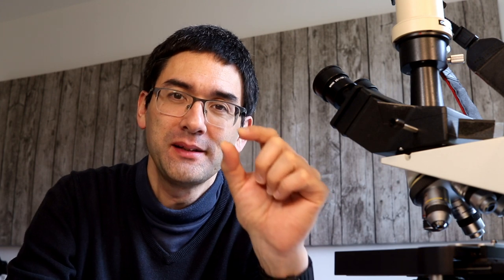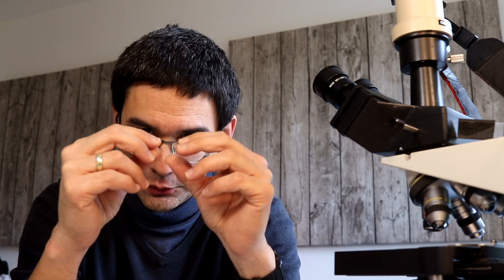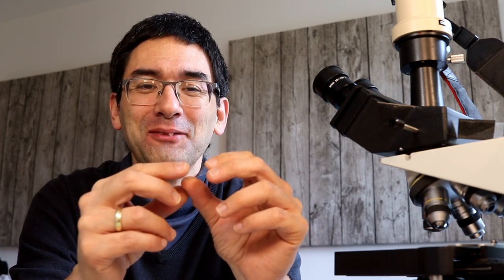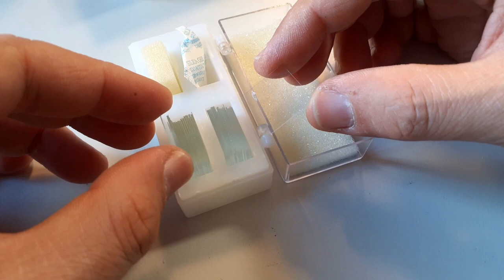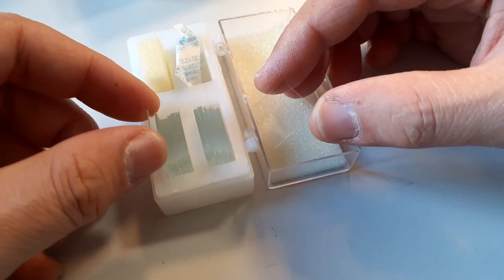Hi, MicrobeHunter here again. Today I want to talk again a little bit about cover glasses, and specifically I want to do a little experiment. I want to investigate the effect of cover glass thickness on image quality. First of all, cover glasses can have a profound impact on the image quality.